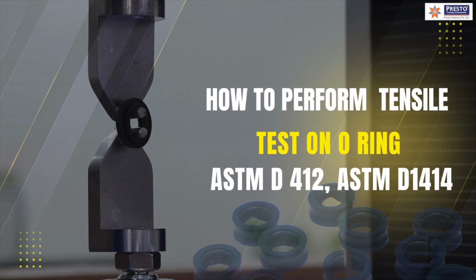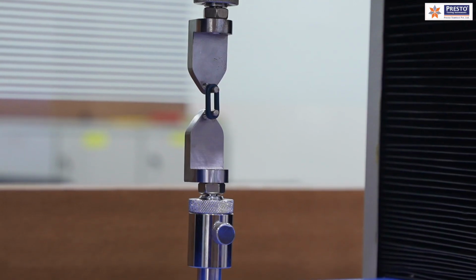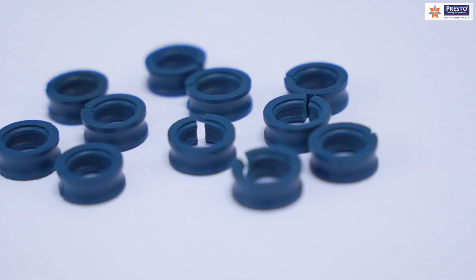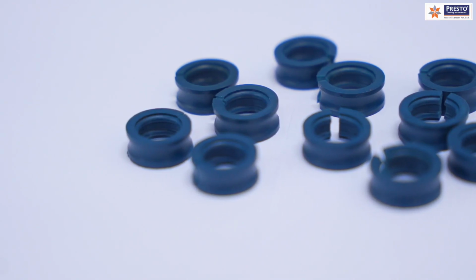Hello everyone, in this video we will be discussing the tensile testing of O-rings. We will be testing the mechanical strength properties of the O-rings. It is important to understand why these are used and why it is important to check the reliability of this kind of component.